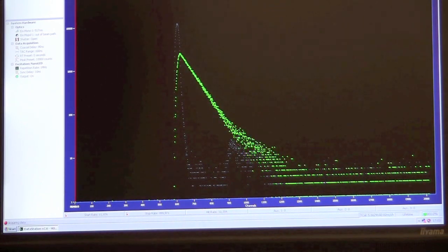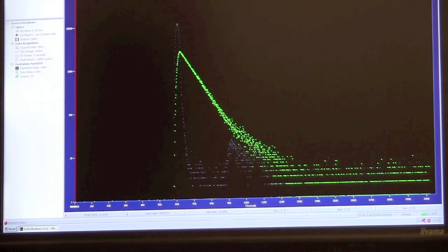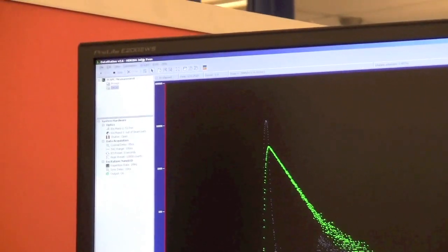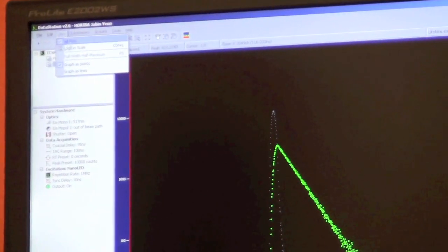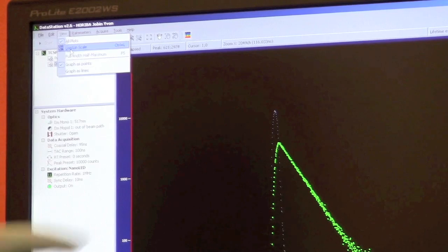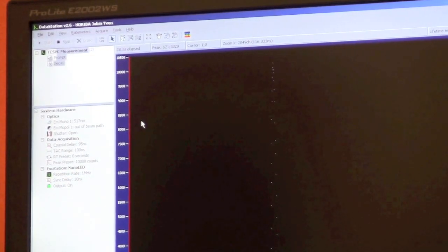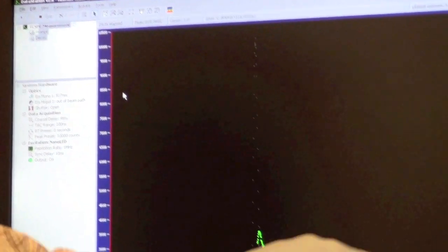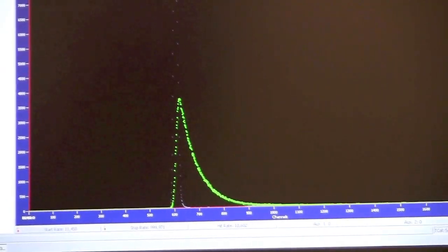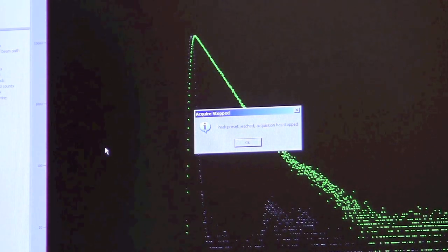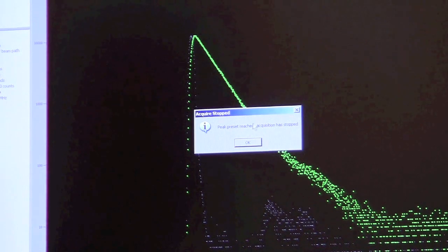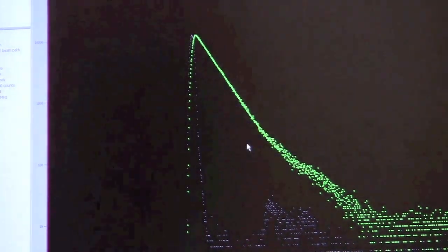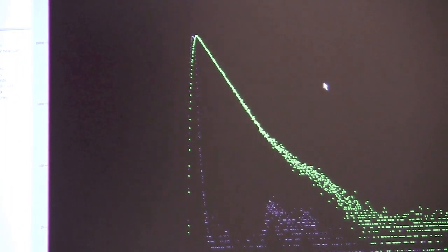Another interesting thing you can do while watching is switch from log to linear scale. The log scale looks like a straight line, whereas linear scale you can actually see the decay profile. We have finished data acquisition and now measured the lifetime of Alexa 488.